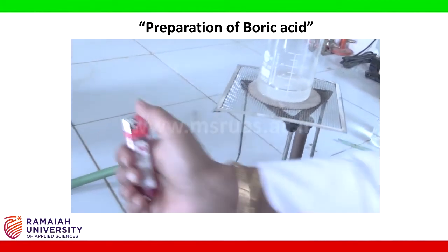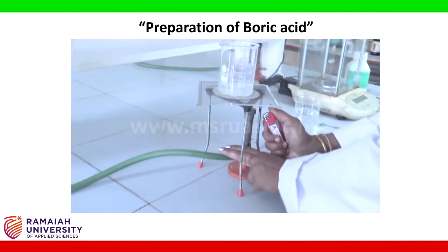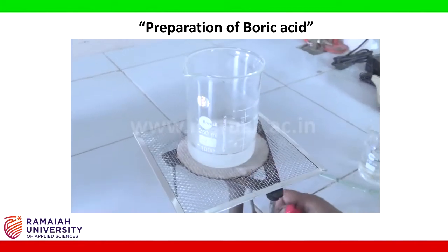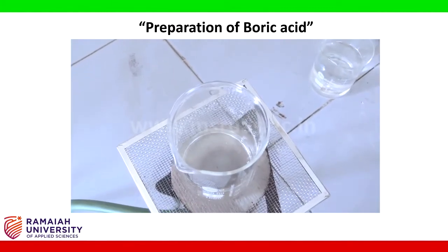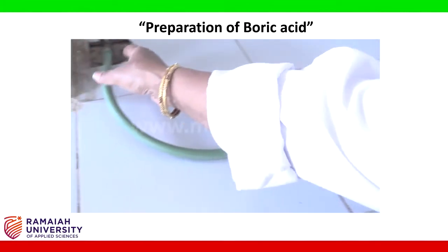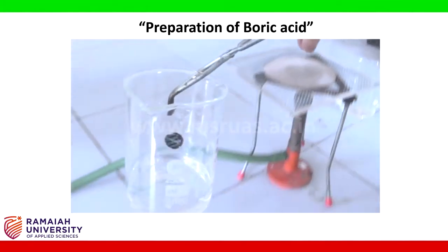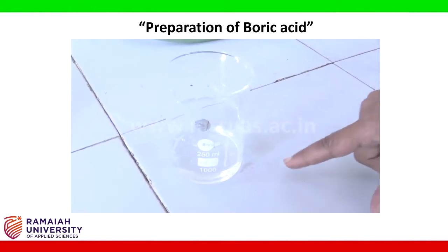Now heat this mixture for 10 to 15 minutes. After boiling for 10 to 15 minutes, put off the burner. Allow it to cool, first at room temperature.